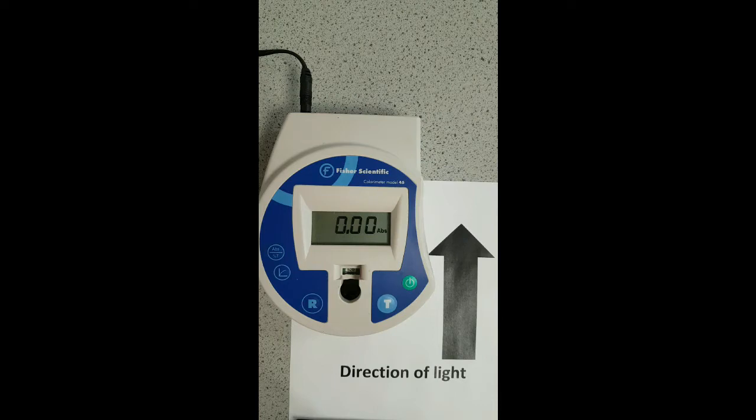We can use our absorbance values to determine the concentration of an unknown sample, but in order to do this we must first produce a calibration curve or plot by analyzing a series of known concentrations.